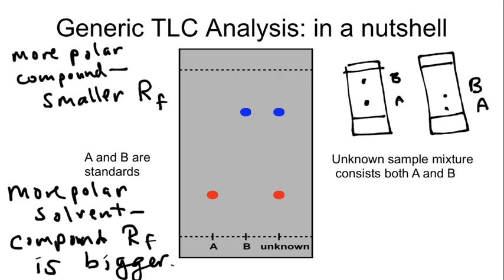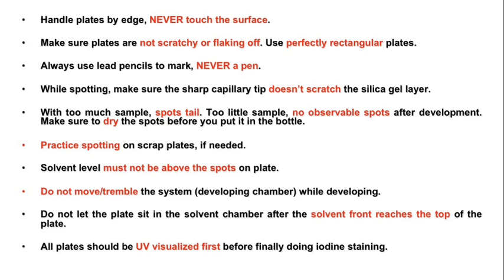Okay. Last thing that I'll leave you with, remember that these slides are posted to Blackboard, so you can take a look at these. These are all going to be important pieces of information that you should not do when running your TLC plate. Okay. For instance, if your hands touch the TLC surface, okay, you've got organic materials all over your hand, and you're made out of organic materials, right? So if you touch the surface with your hands, you're now contaminating the top of the plate with organic materials. It's going to mess up your plate. It's going to make it a big mess. You aren't going to be able to figure things out.